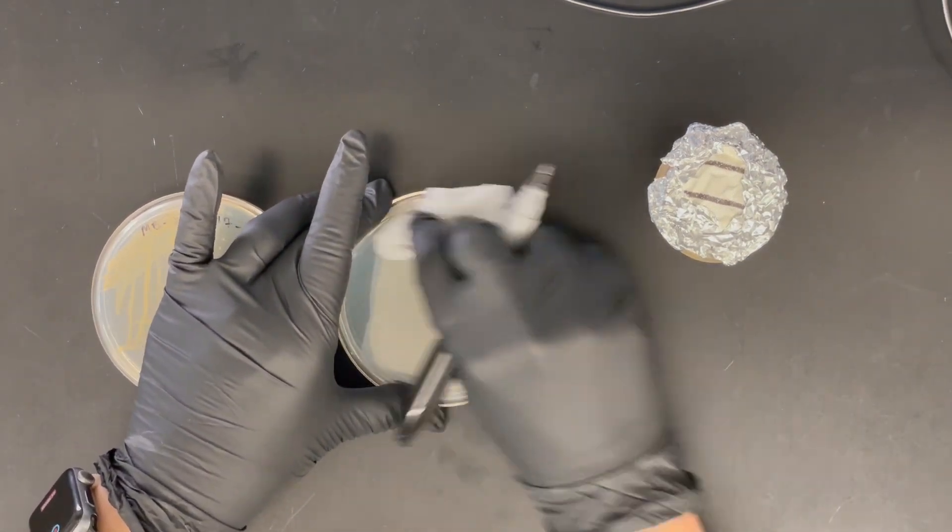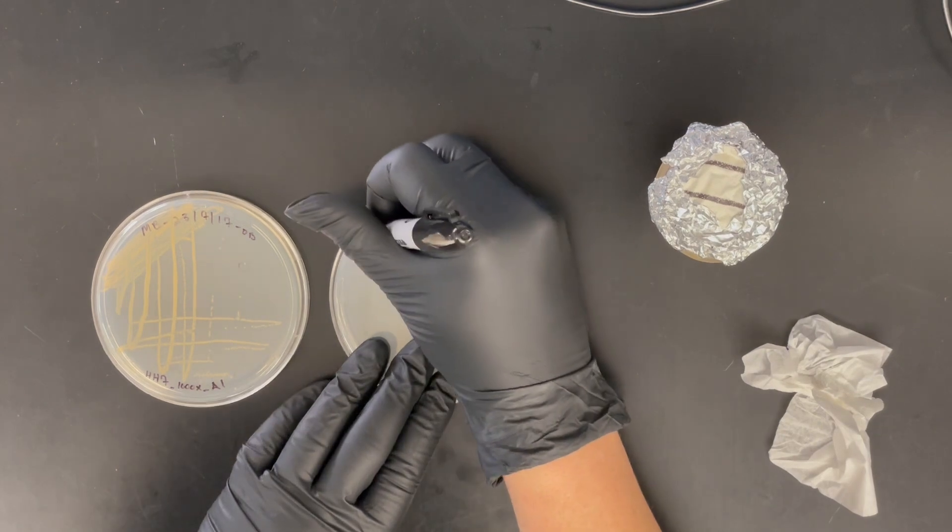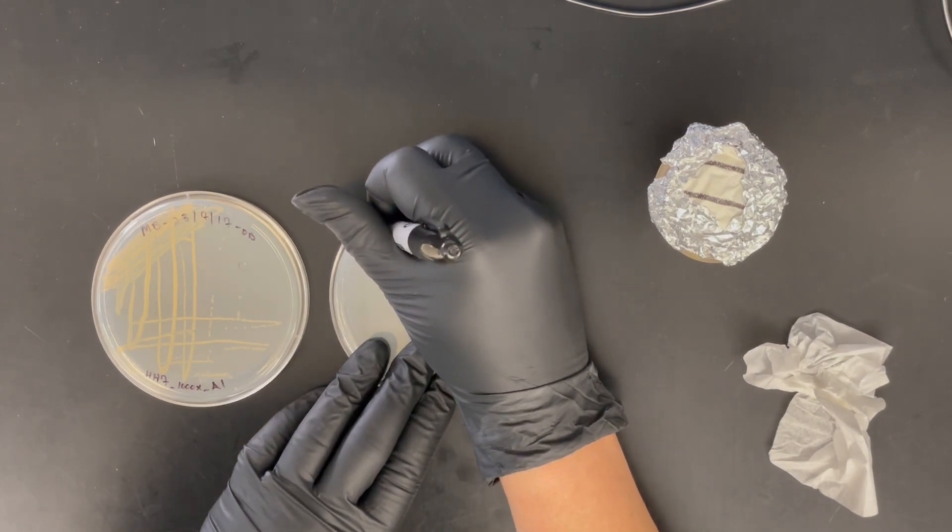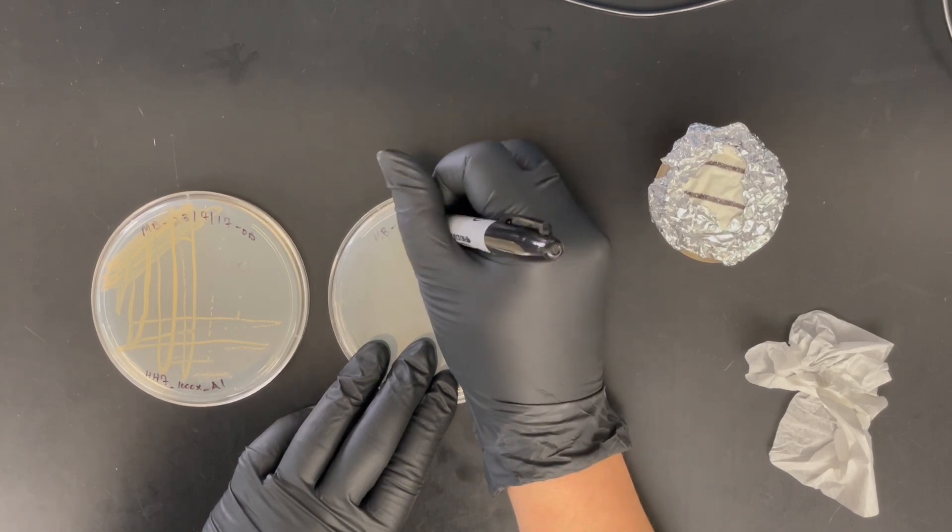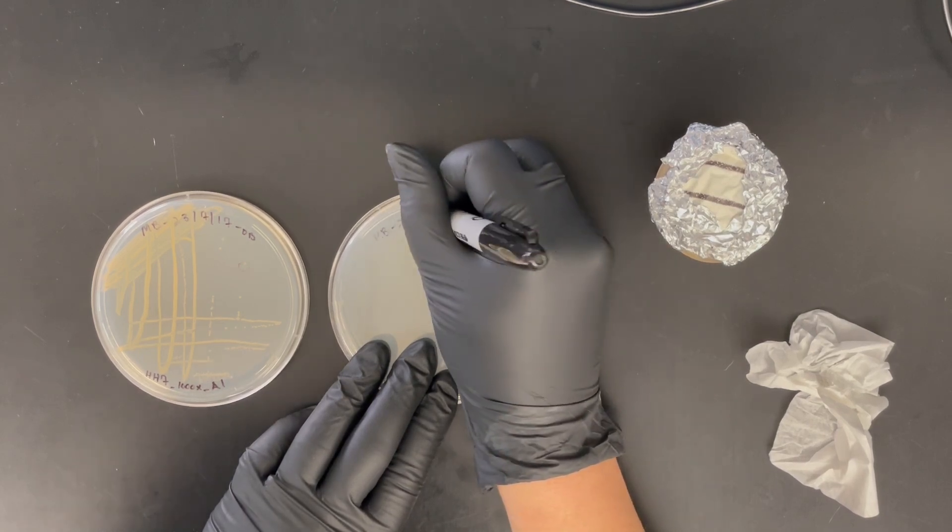That last number after A1 on the bottom of the plate, it's going to be A2 instead. That's going to indicate that it's the second streak from the A colony that you picked off of the HH7 1000X dilution plate.